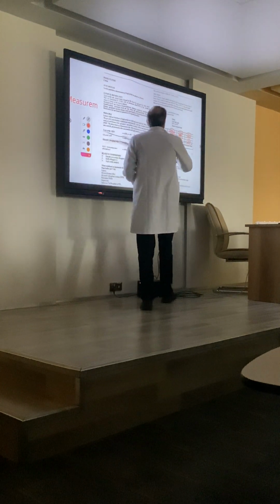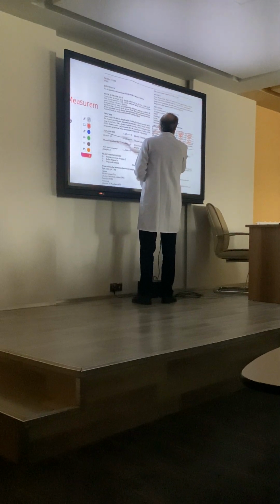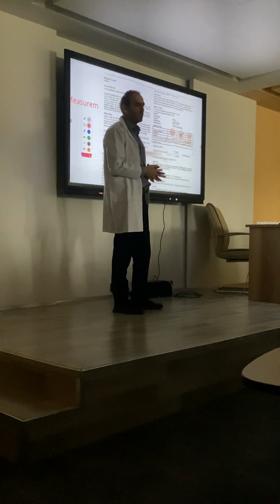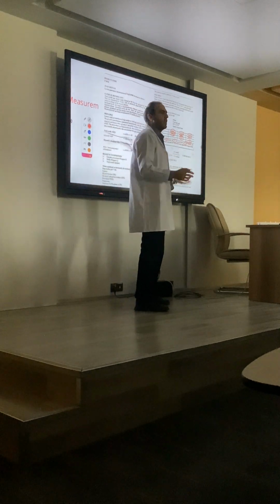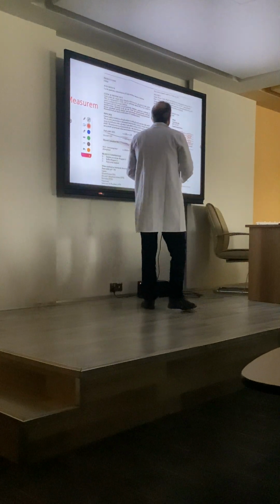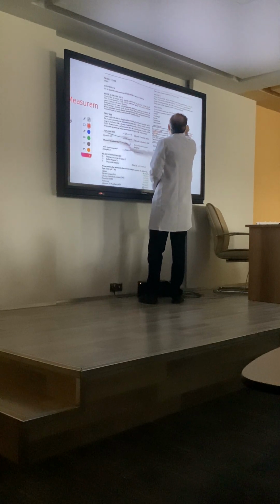After that, we have to incubate at room temperature for 10 minutes or in a 37 degree water bath for 5 minutes. I would ask them to turn on the water bath, but I don't think so. You can incubate at room temperature for 10 minutes. After 10 minutes, measure at 546 nanometer.